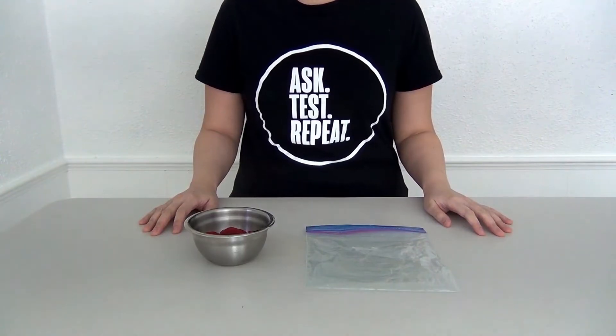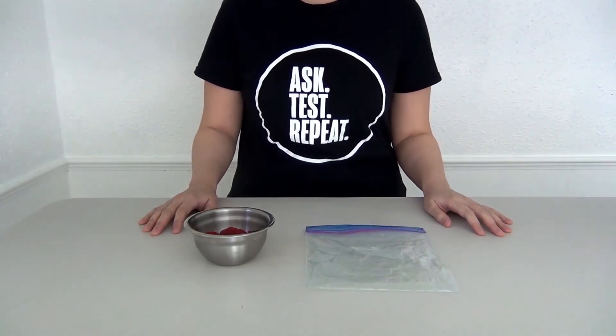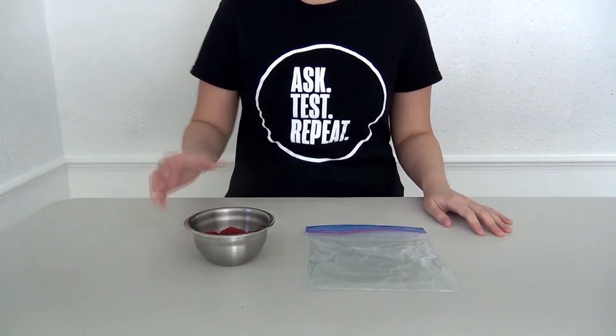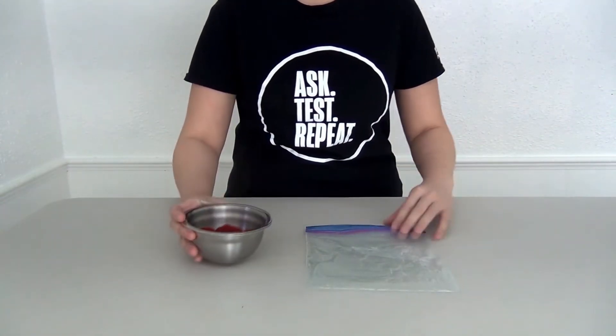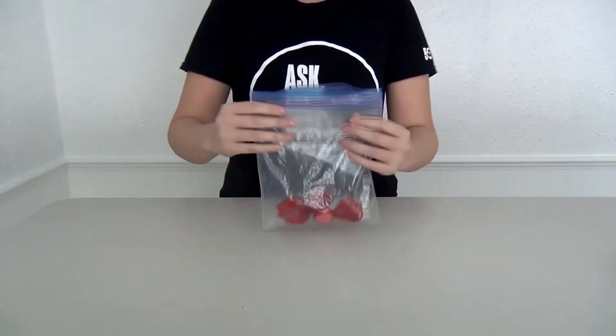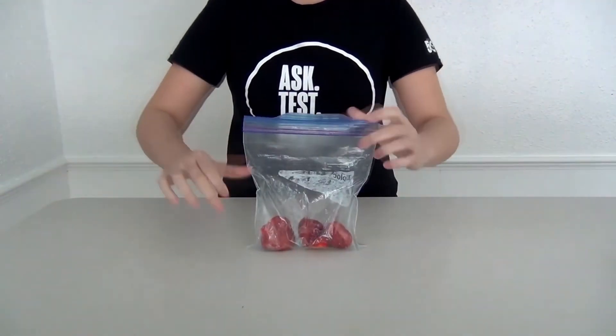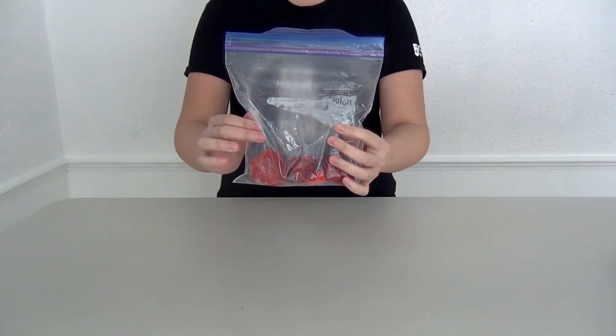For the experiment, the first thing you're going to want to do is to get your alcohol into the freezer so it can chill. We'll be using it later on. Next, you want to grab your produce and you want to put that into your baggie. You want to seal up your bag, try to get out the air, and then you want to mash those strawberries until they're mush.